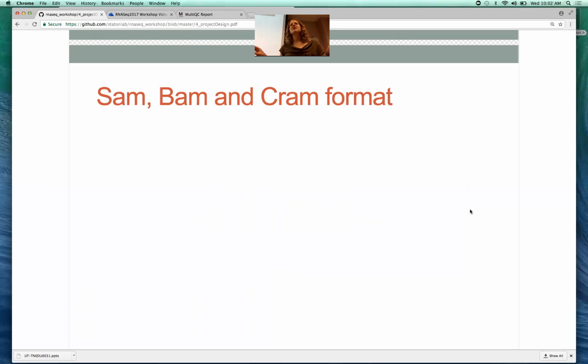And so to do statistics on those, you have to build up coverage. You just have to build up the amount of sequencing you're doing. It's like this exponential curve, where a very small handful of genes are super highly expressed, and they're eating up a lot of your sequencing power. Then you come back down to the genes with mid to low expression, and you're still potentially very interested in those, so you have to build up the coverage to get enough reads to do statistics on those. So it's basically cover everything.